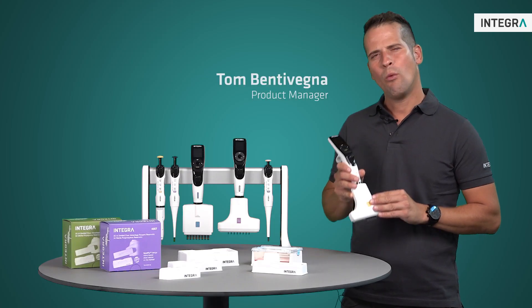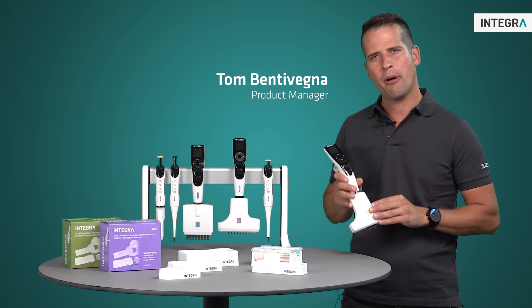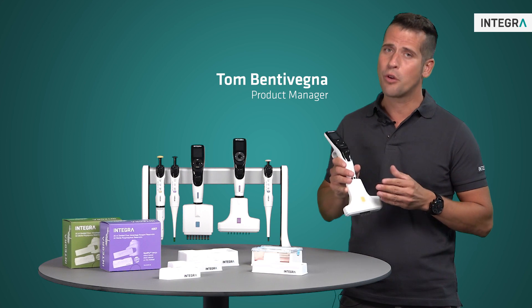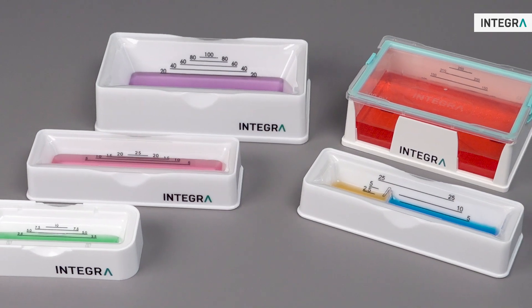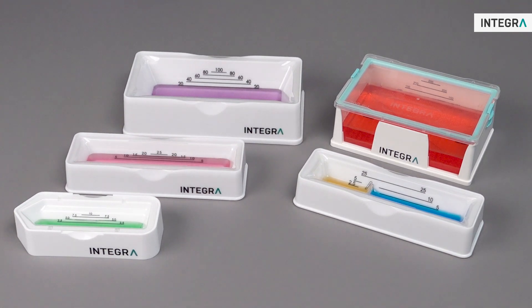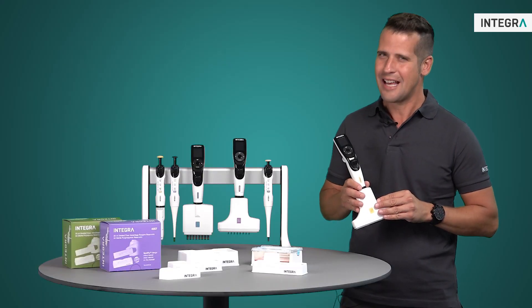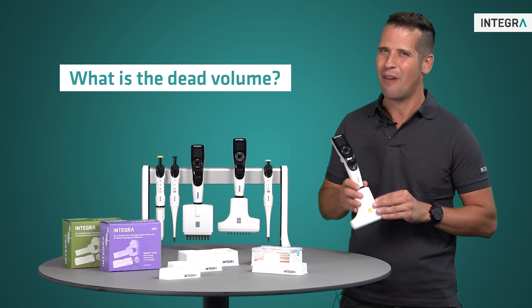Hey everyone! One of the benefits of using multi-channeled pipettes is having multiple channels pipetting simultaneously to increase productivity. Reagent reservoirs are commonly used, but when filled with precious or costly reagent, all scientists have the same question: what is the dead volume?